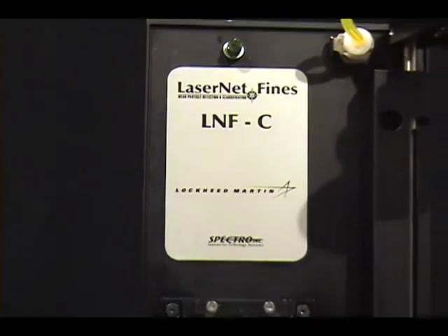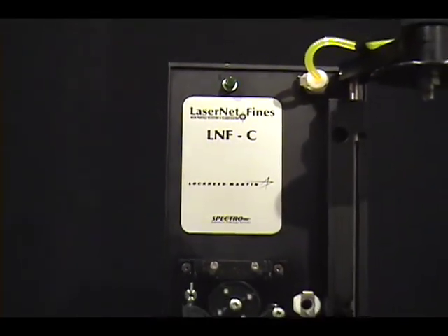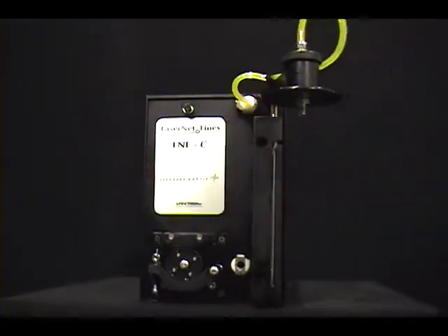Developed by Lockheed Martin and distributed exclusively by Spectra Incorporated, the Lasernet Fines, or LNF, is a benchtop particle counter and particle shape classifier.